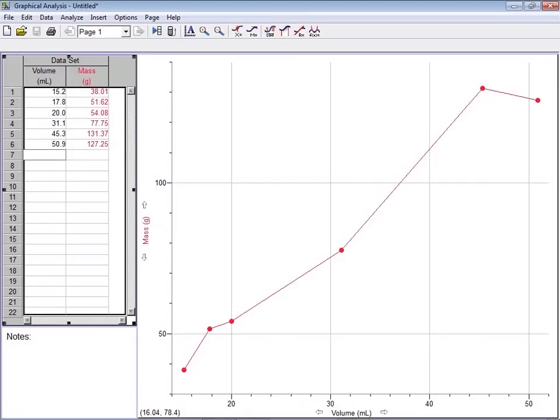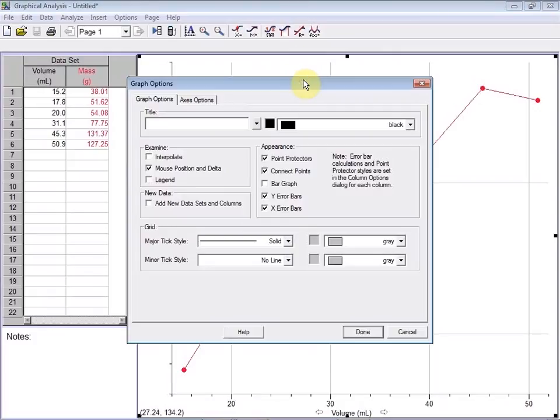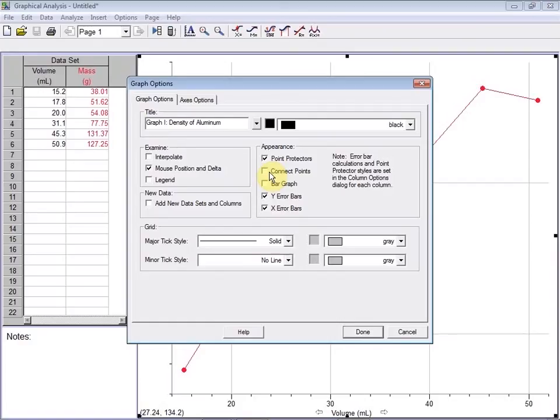Notice that the graph axes labels and units come from the data table labels and units, but we're still missing an appropriate title. Double-click on the graph to open the graph options window. Here we can give our graph its title, and we can turn off the Connect the Dots line by unchecking Connect Points. By clicking on the axes options tab, we can also view or edit options regarding our axes scales, something you'll need to do if you plan on extrapolating from your graph.